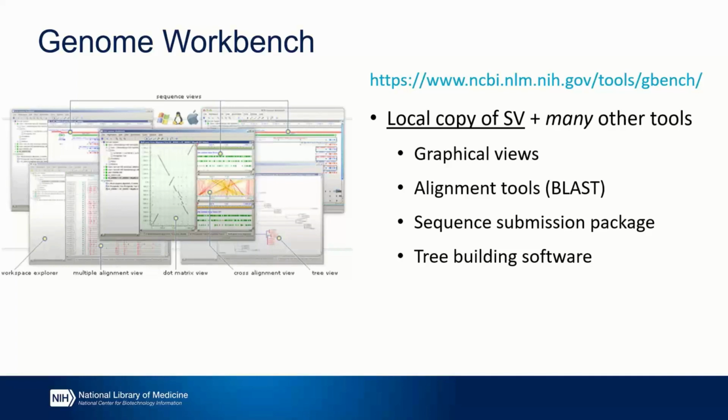And another popular feature is actually the submission pipeline that is built into the Workbench so that you can prepare and submit your sequences all from the same UI. And finally, just because I enjoy using them, I'll also point out that the Workbench also offers phylogenetic tree building software so that you can make and visualize your phylogenetic tree all in one tool.